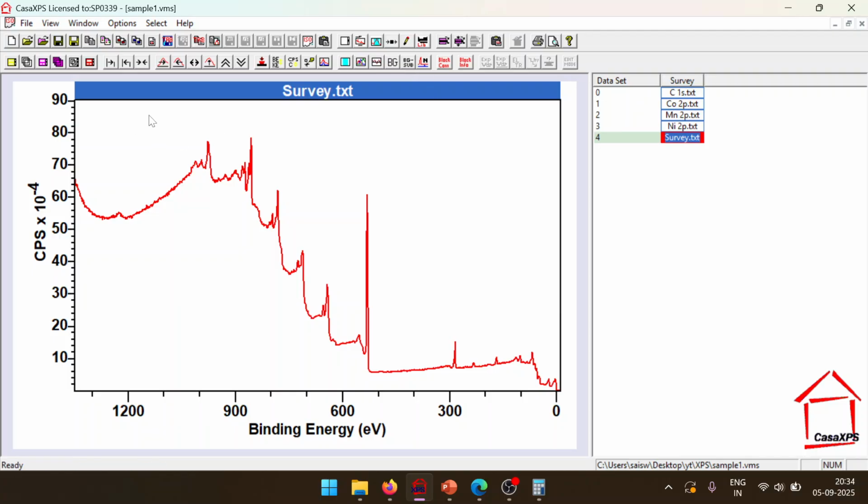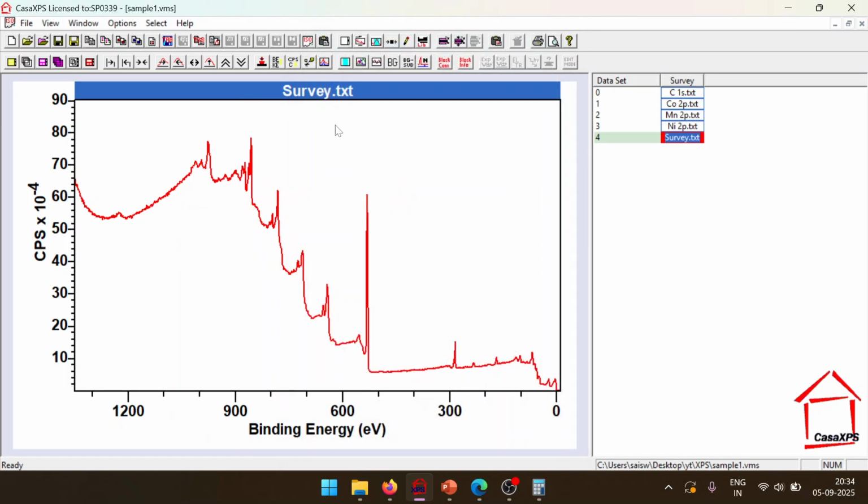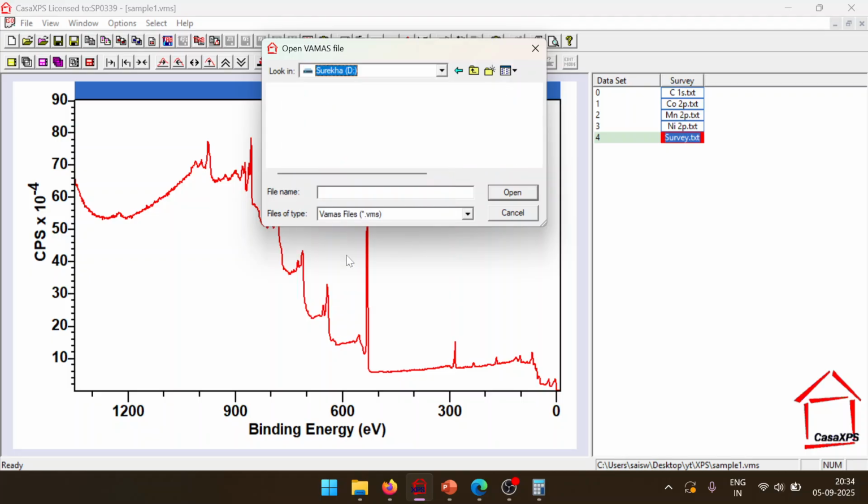Okay, generally in here you can see a table kind of thing where you have these things. So you get here a table which says RSF equal to this much, and I'll show you an example for that if I can.